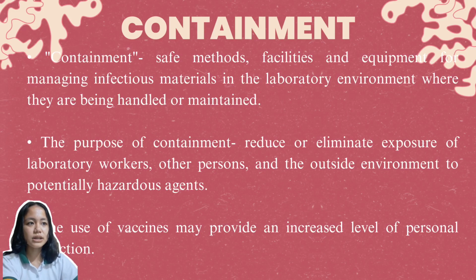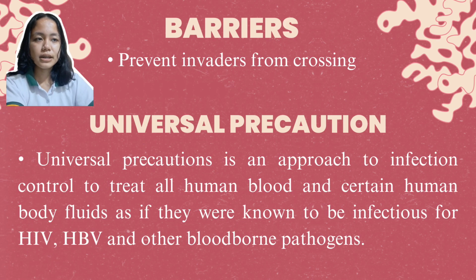Containment refers to safety methods, facilities, and equipment for managing infectious materials in the laboratory environment where they are being handled or maintained. The purpose of containment is to reduce or eliminate exposure of laboratory workers, other persons, and the outside environment to potentially hazardous agents. The barriers prevent invaders from crossing.